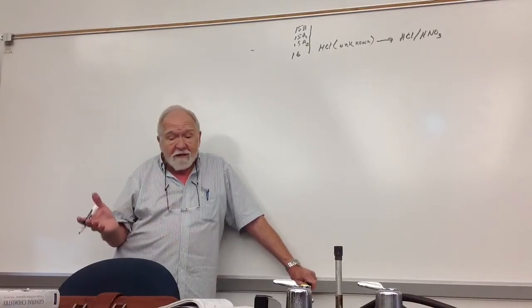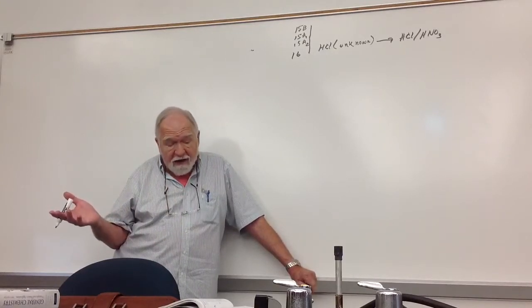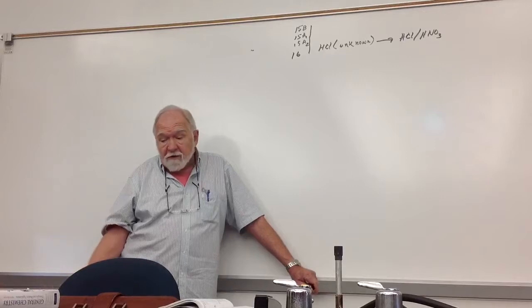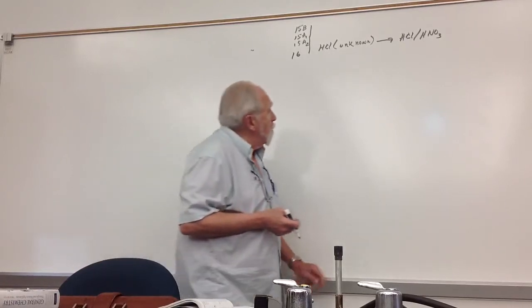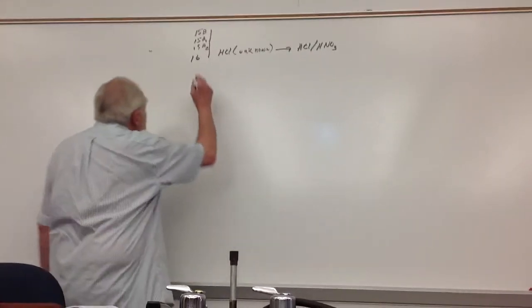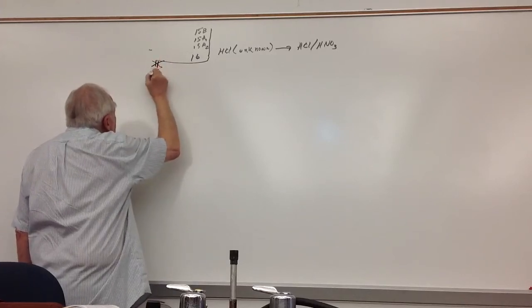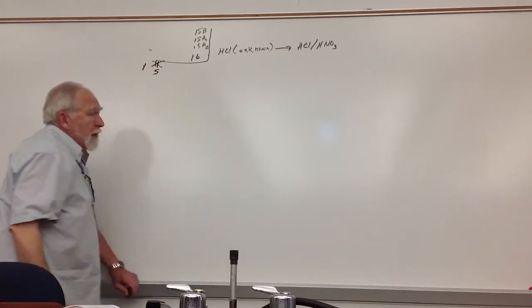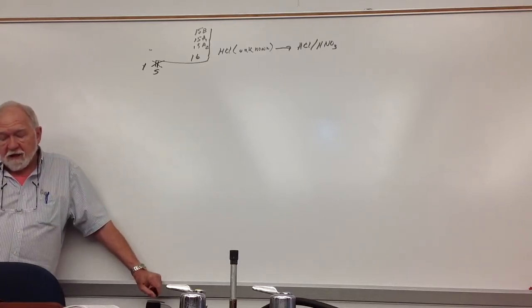It's an element, and when we get to the anions, we're only going to analyze for anions, not for elements. So whenever you make sulfur, you're going to discard it. And so you keep boiling and replenishing until all that's left is a yellow precipitate of sulfur. And sulfur always comes out yellow. It forms that little lumpy thing.